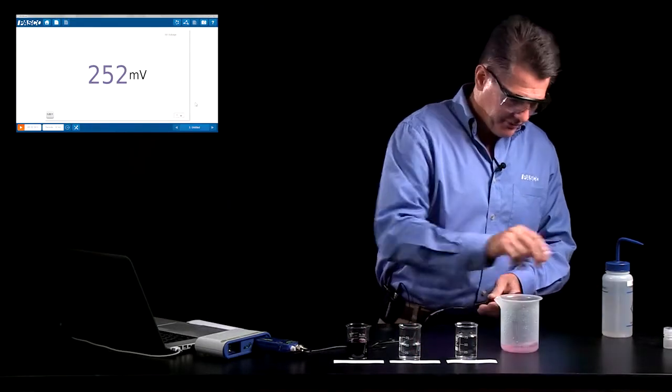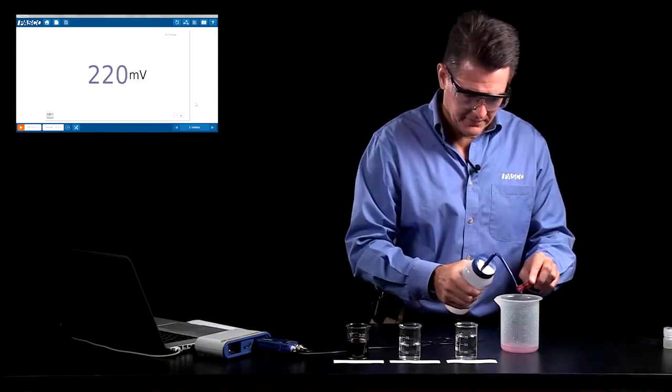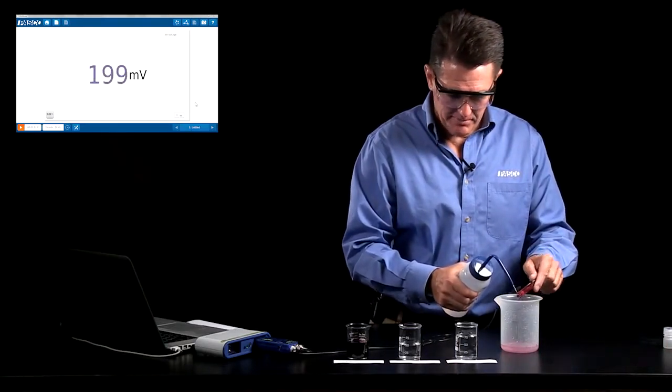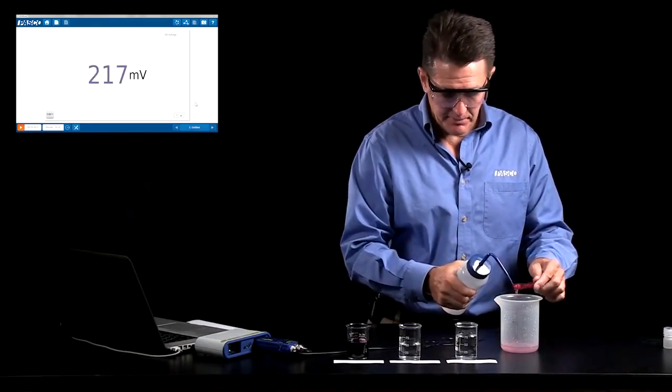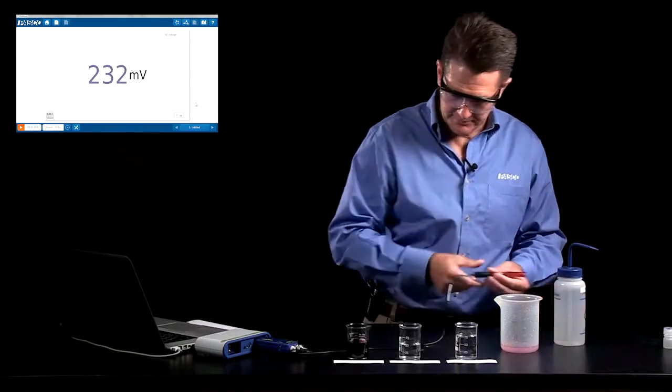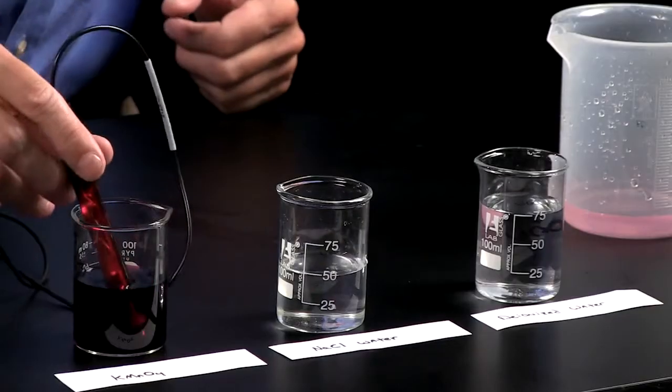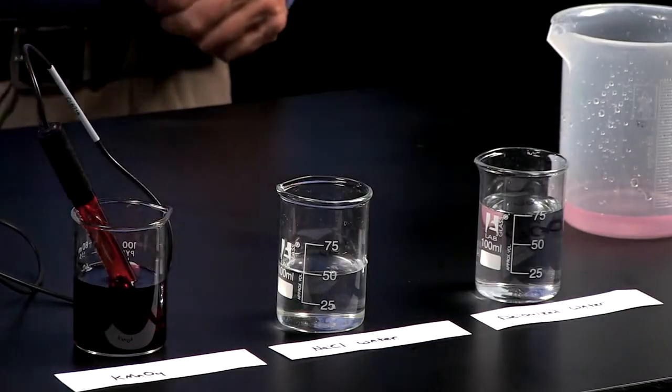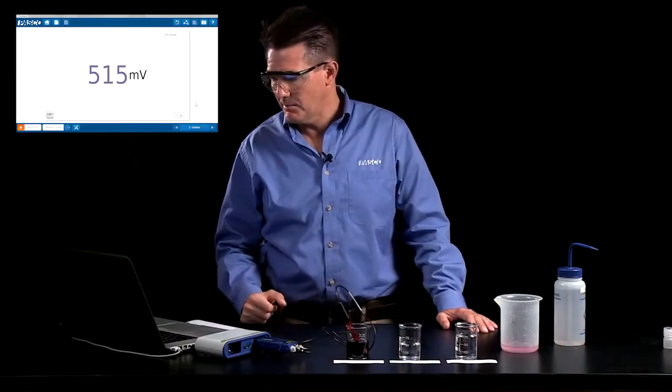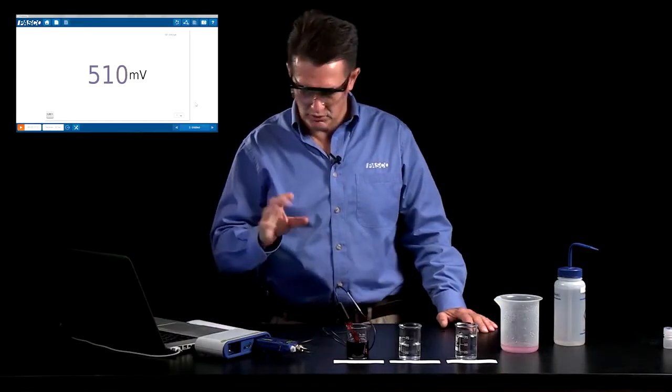I'm going to rinse this off before I place it in my next solution, which is potassium permanganate. Potassium permanganate is a known aggressive oxidizer, so I would expect to get significantly higher readings by placing it in there. And yes, I can see that I'm about 513 or so.